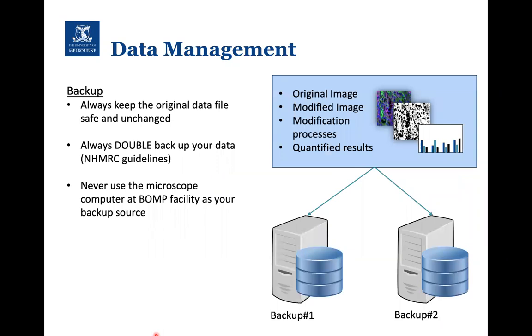Next thing in data management is to back up the data. We have a lot of users accessing our instruments at the University of Melbourne, so it's never a good idea to use those instruments as data backup. From time to time, we've had viruses on the systems that completely wipe the data. So it's really important to get that data off the acquisition computer as quickly as possible.